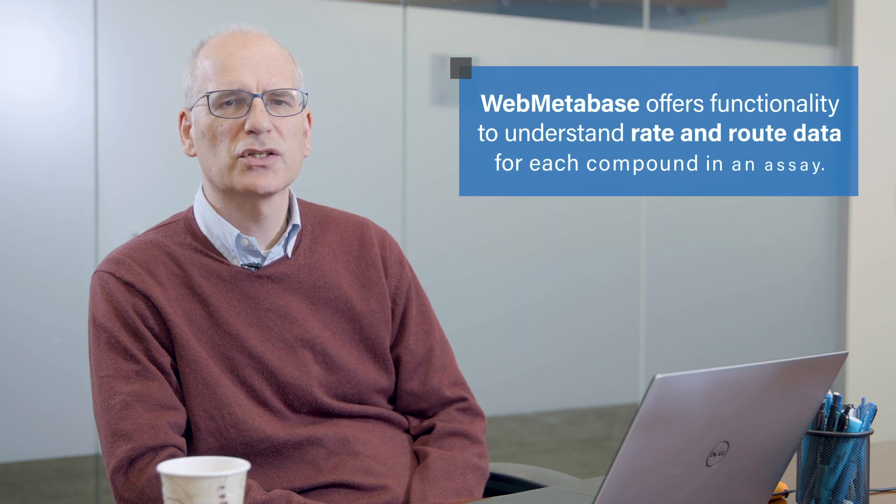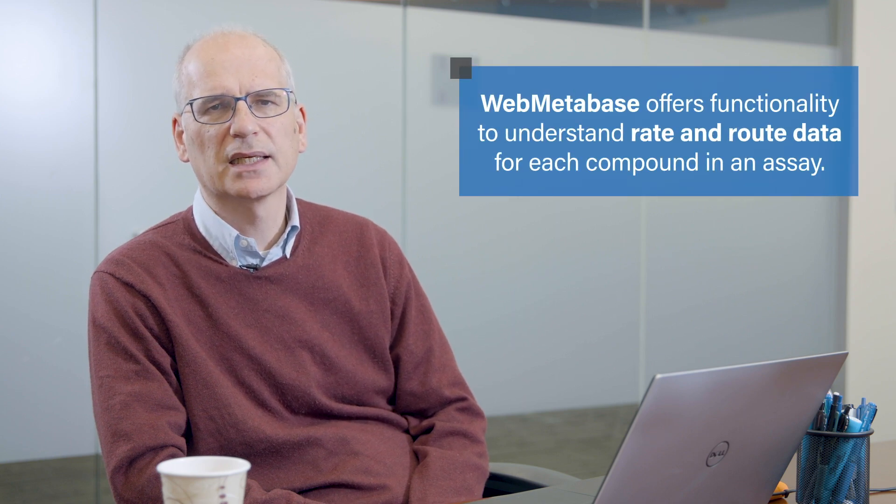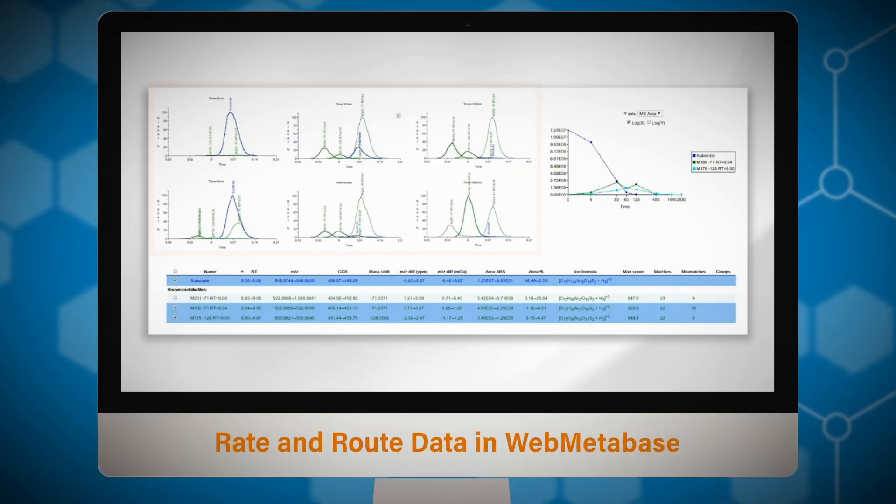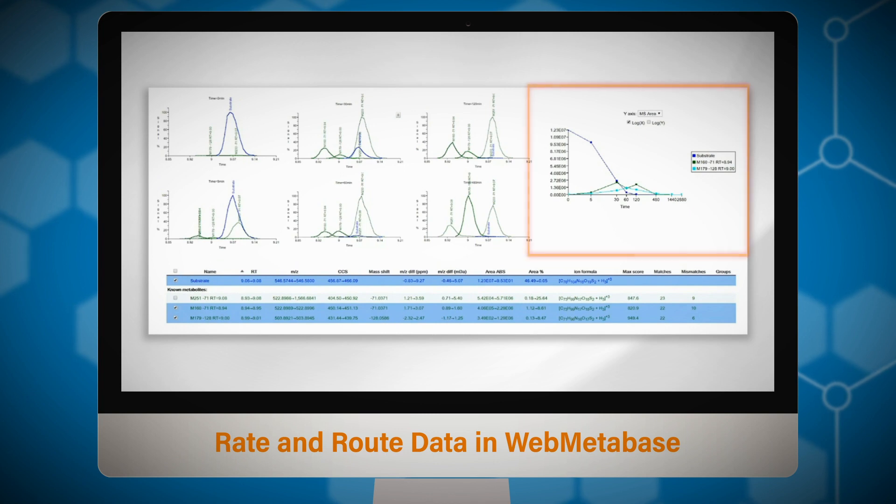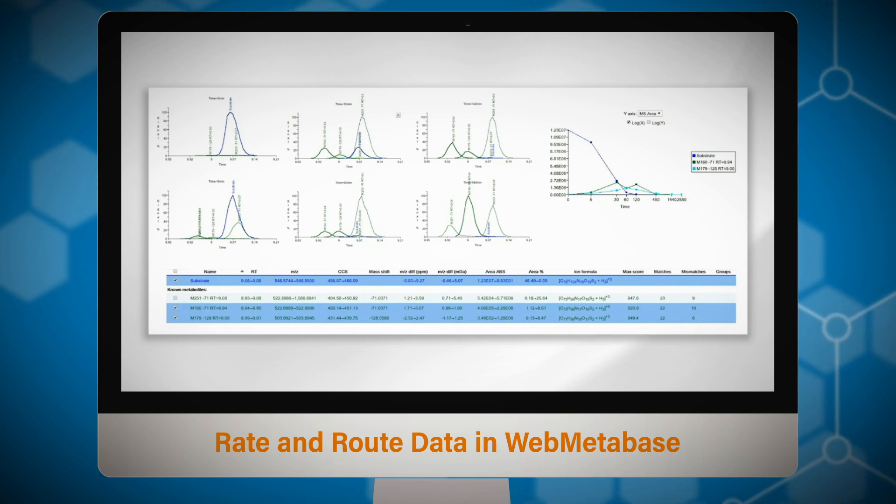Web MetaBase offers functionality to understand both rate and route for each compound in the assay. Here we can review the chromatograms at each time point, look at the response time curves for both parent and any components that we're interested in, and see the rationalization that the software proposes for each metabolite. The platform can handle both small molecules and peptides including cyclic and non-natural forms.